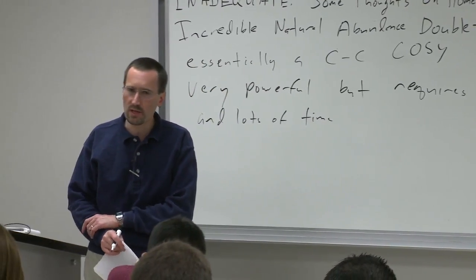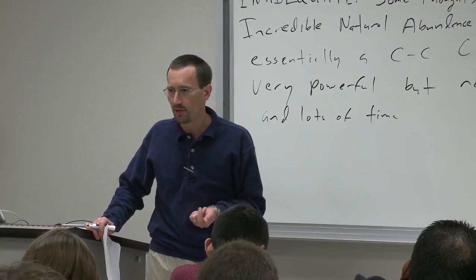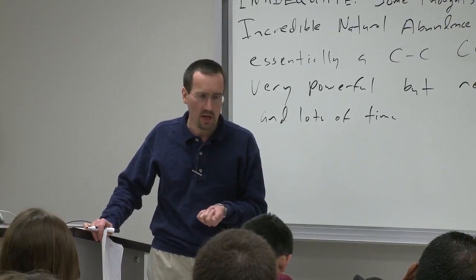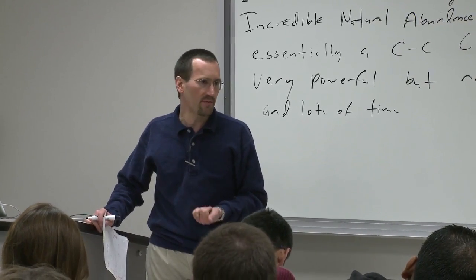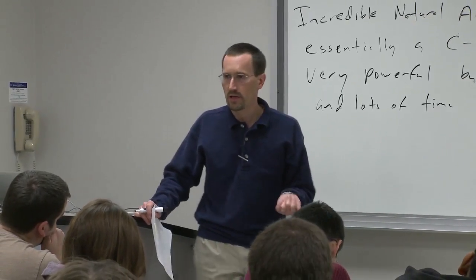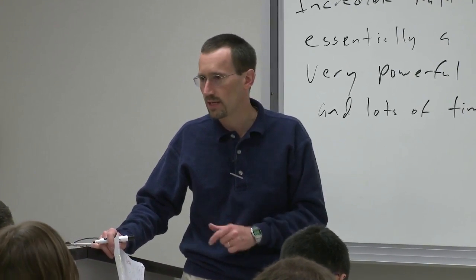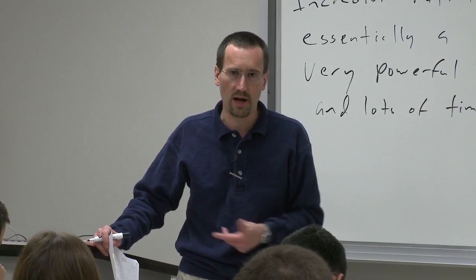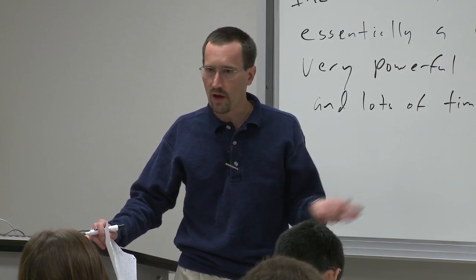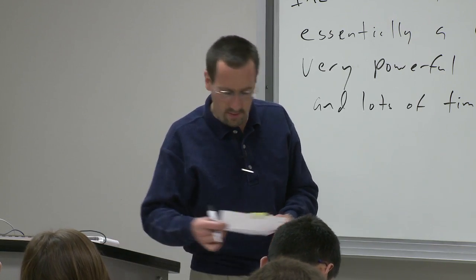In other words, if you're dealing with some rare natural product where you've isolated a couple of milligrams, right now it's essentially out of grasp. If, on the other hand, you have some side product in a reaction and you think this is key to optimizing a reaction, maybe not a late-stage intermediate in a synthesis, but maybe in a methods project, and you're trying to suppress something, and you can get yourself 100 mgs, and you just can't get a handle on it any other way, this may be a way.